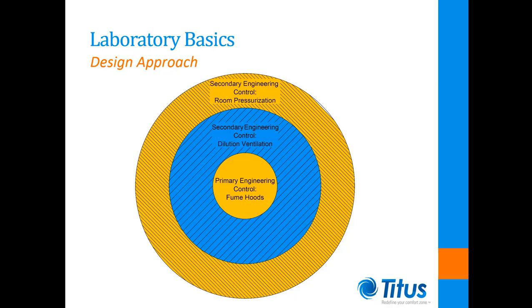This is achieved through the use of dilution ventilation, purging any contaminants that may have escaped containment within the hood, and by maintaining a negative pressure relationship to the adjoining spaces. In order to maintain a negative pressure relationship within the laboratory space, we need to supply less airflow to the lab than exhausted from the room. The volume of exhaust is based on the combined exhaust flow rates for the fume hoods utilized and the minimum required air changes per hour. The volume of this offset will depend on how tightly the room is constructed and the desired differential pressure, and is most commonly identified as a set airflow rate typically between 150 and 250 CFM.